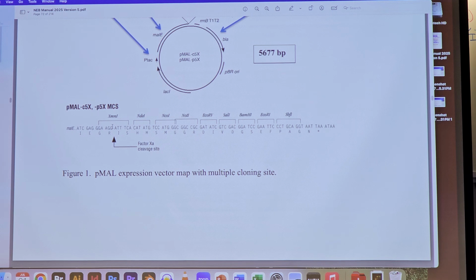We'll make something else, but it won't be our protein, right? Now, I'm going to take you all through this in greater detail when we actually get our sequences, because we're going to be looking really carefully at this position here to make sure that we ligated our molecules together. If everything went well, we should be good there. What possible things can go wrong?